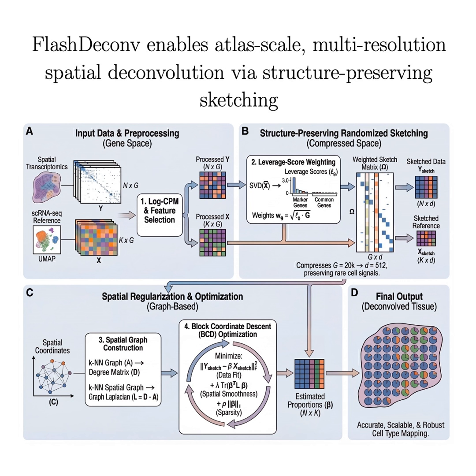And finally, because FlashDeconv was built from the ground up to preserve the structure of rare cells, it found something truly cryptic, a biological structure called the Tuft stem niche. That's right. And this is something variance-based methods would have completely ignored. Tuft cells are a very rare epithelial cell type, and their marker genes have extremely low variance. They rank 21 percentile points lower by variance selection, so traditional methods were just systematically blind to them. FlashDeconv, because it looks for distinctiveness, could see them.